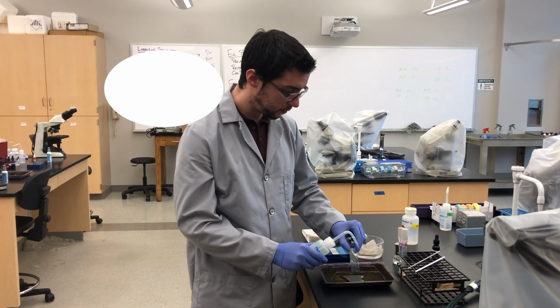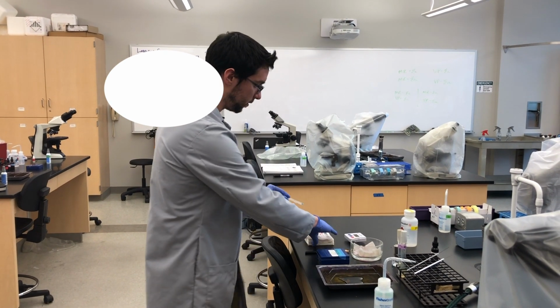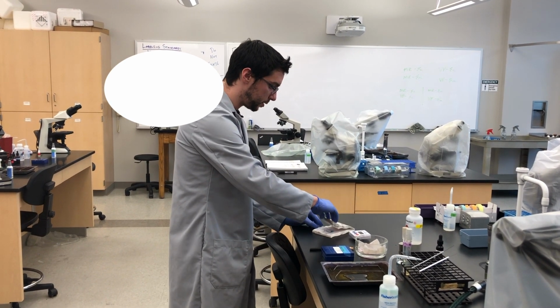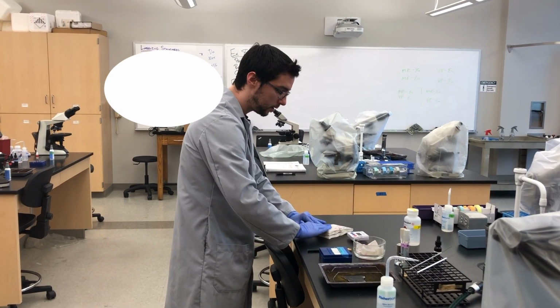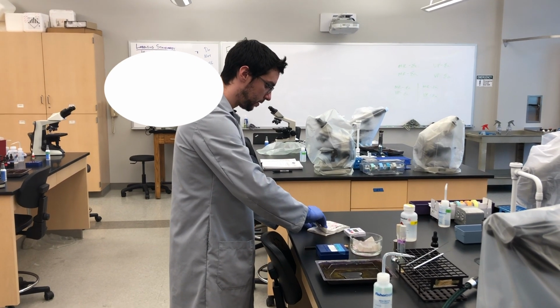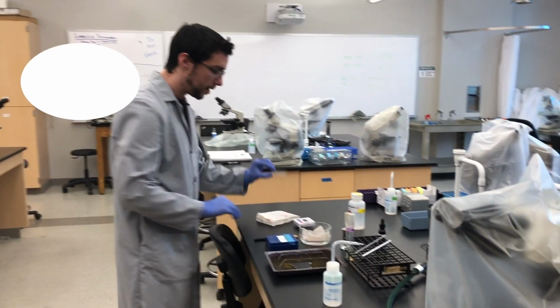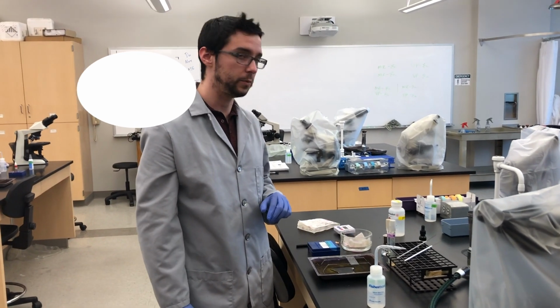And once it runs clean, dab it dry with bibulous paper. Again, be very careful not to rub the bibulous paper. Simply pat dry. And you now have an acid-fast stained slide to look at under the microscope.